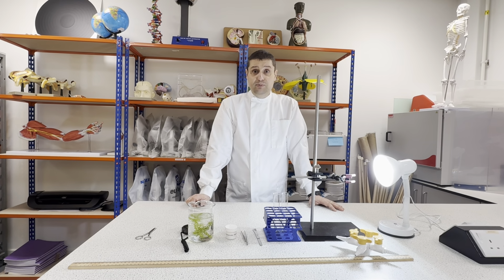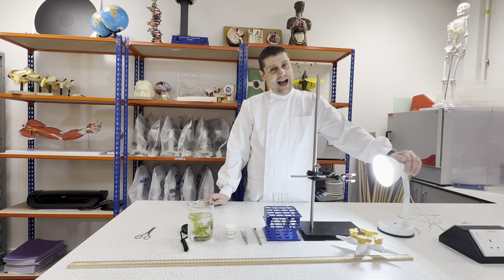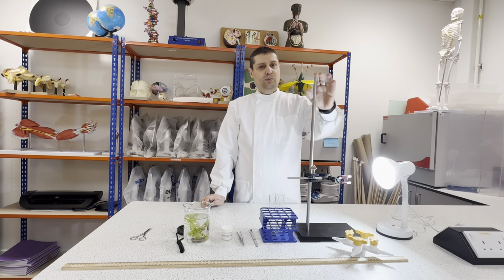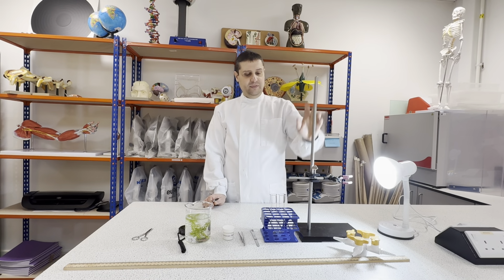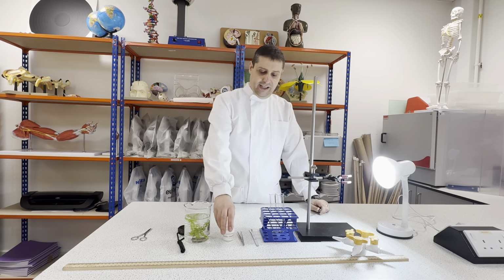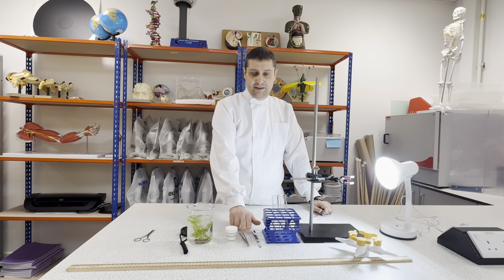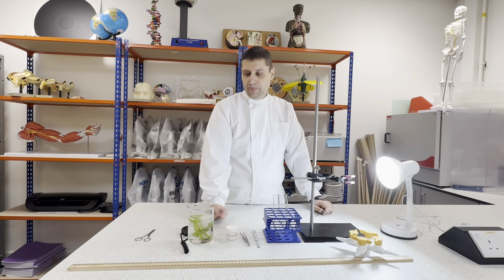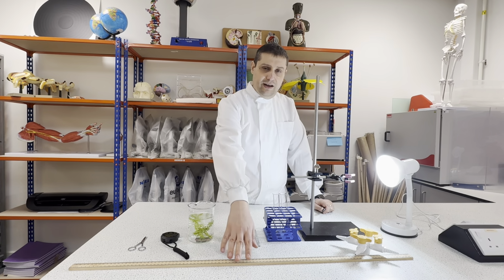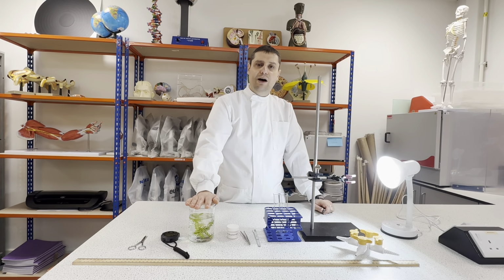So, for this practical, we will need a source of light, ideally LED one. We need a clamp stand, boiling tube, sodium bicarbonate, tweezer, spatula, timer, scissor, a measuring ruler, and pond weed.